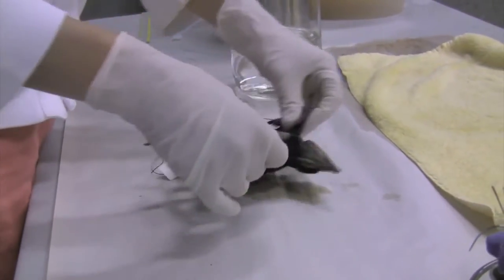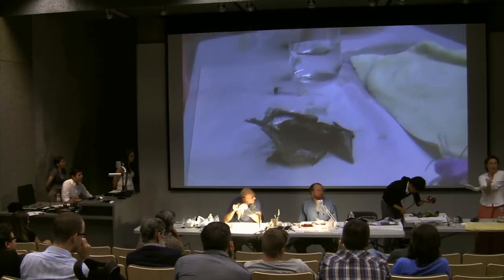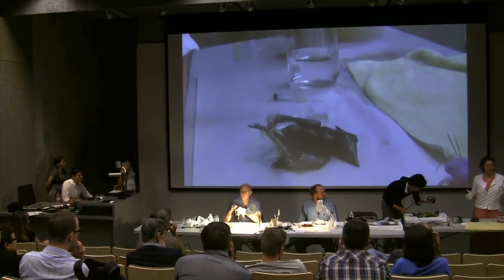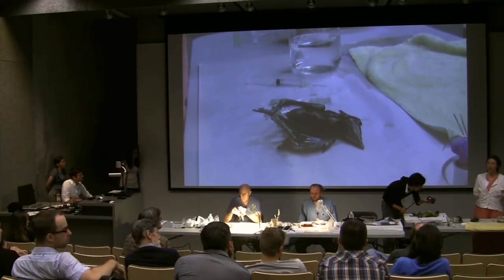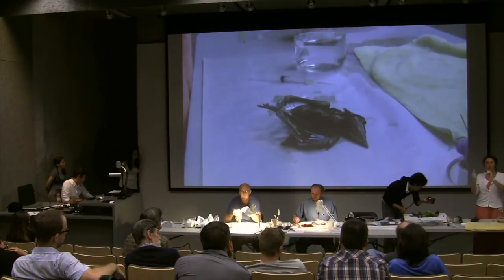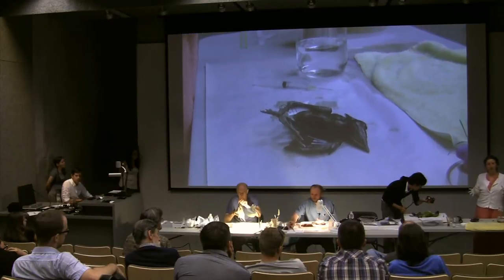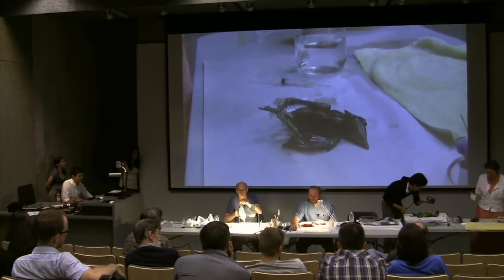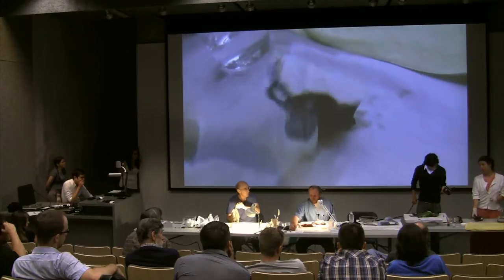Then I teach what I call the nine-point injection. The nine-point injection is definitely overkill for something like a goldfinch or a small passerine, because formalin is going to fix by permeating the tissue pretty quickly. But it's good to have a model in your head for where you would need to inject if you needed to get your fluid deeper into the specimen — the whole idea is to introduce the fluid so that preservation occurs before degradation. People are still generally preparing using formalin as their primary fixative.